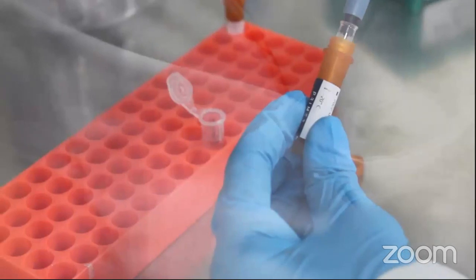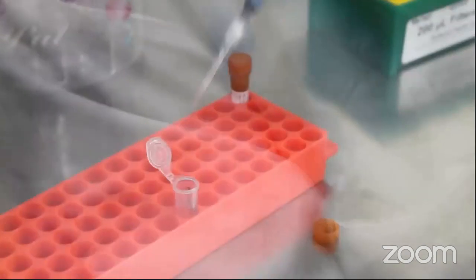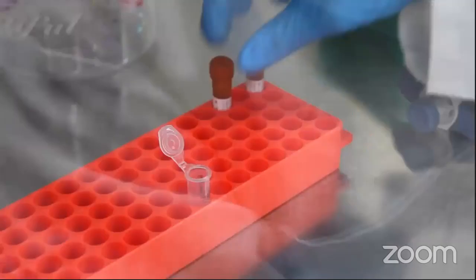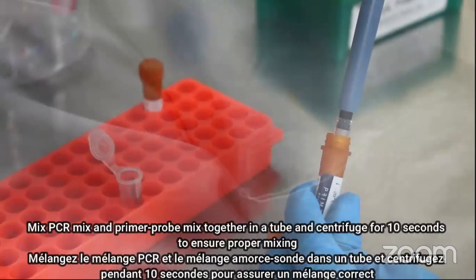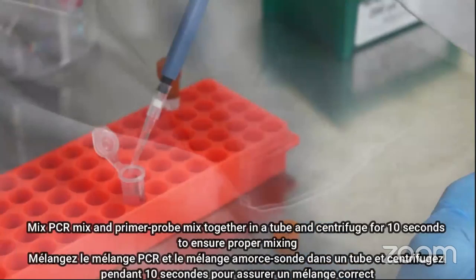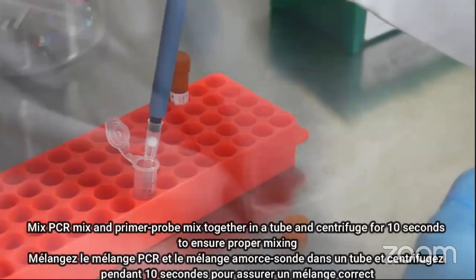It is recommended that before taking the primer probe mix, gently centrifuge it, short spin actually, because when you are preparing the primer probe mix, there will be some which will be on the cap or on the walls of the tube. So just spin it to settle all the drops down, and you can then pick up the whole volume actually. Otherwise, you can miss some of the volume.